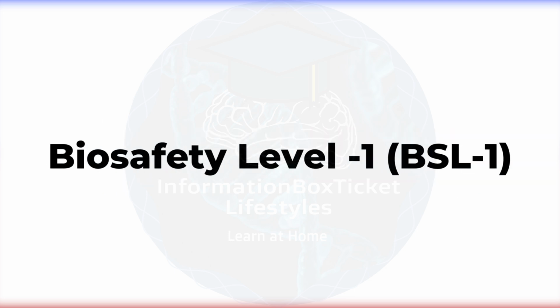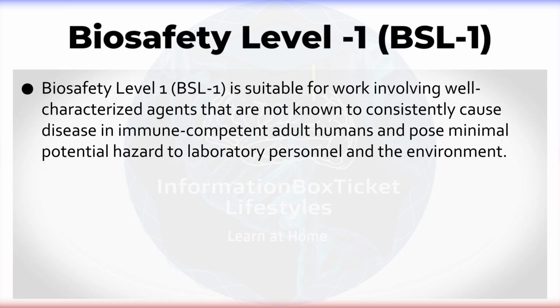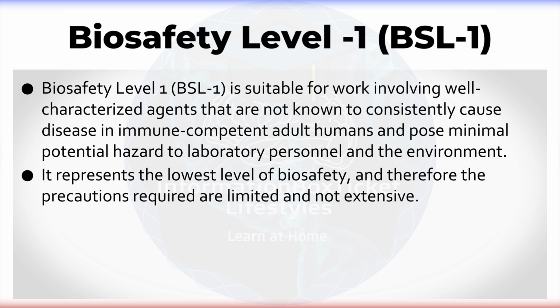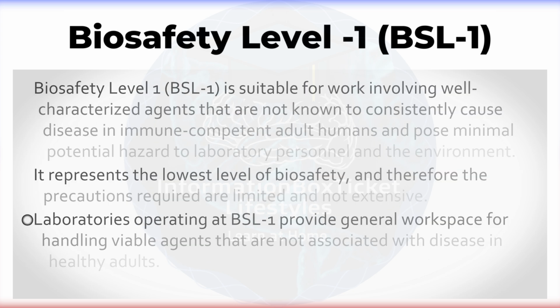Biosafety Level 1. Biosafety Level 1 is suitable for work involving well-characterized agents that are not known to consistently cause disease in immune-competent adult humans and pose minimal potential hazard to laboratory personnel and the environment. It represents the lowest level of biosafety, and therefore the precautions required are limited and not extensive. Laboratories operating at BSL-1 provide general workspace for handling viable agents that are not associated with disease in healthy adults.